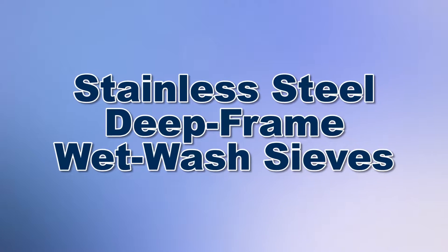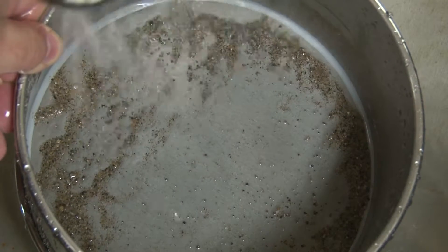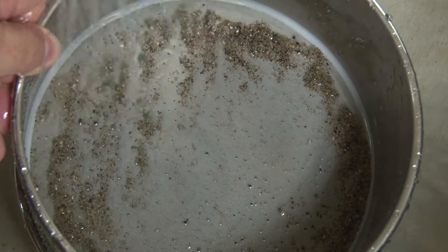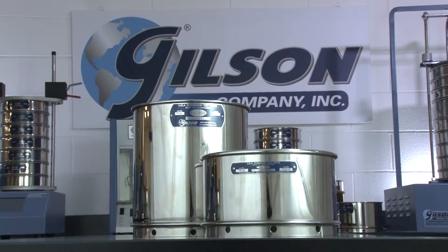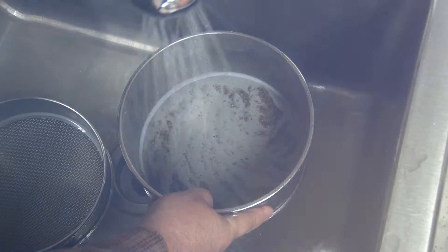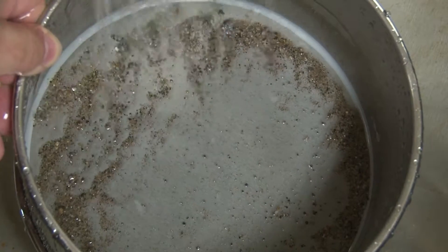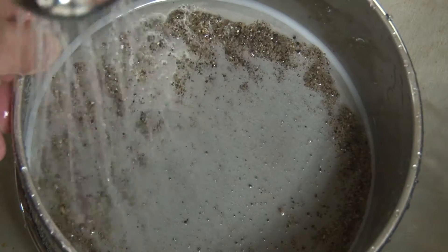When you need to prepare specimens with high fines content for effective dust-free testing, or to isolate specific fractions for further testing, then Gilson is your best choice. Wet-washing sample material over a sieve using rinse water or a gentle spray serves as an effective sizing method when only one or two size fractions are to be determined.